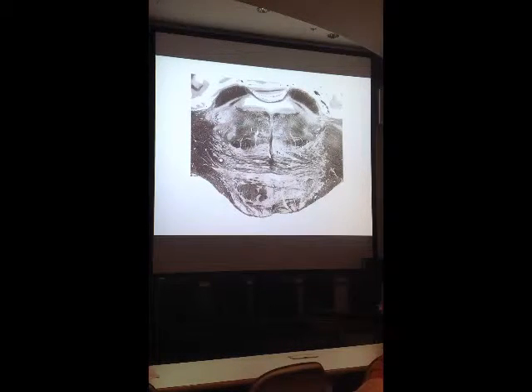Again, if I were to ask a question like that, I would likely just say, hey, name the major nucleus that dominates this area through here. Okay, you'd have to know it.